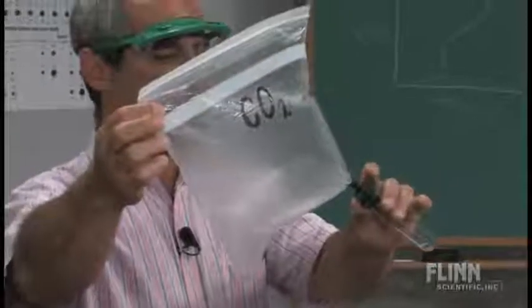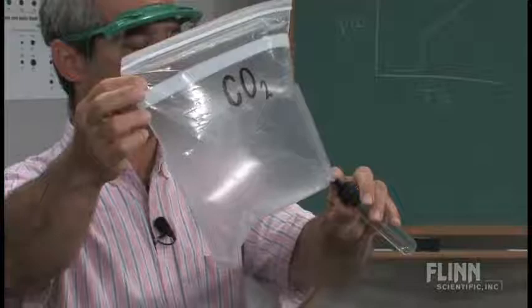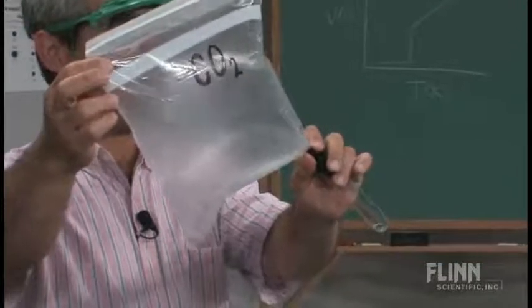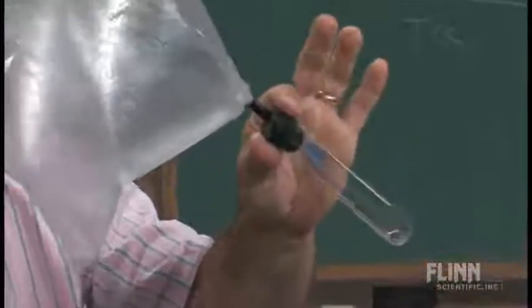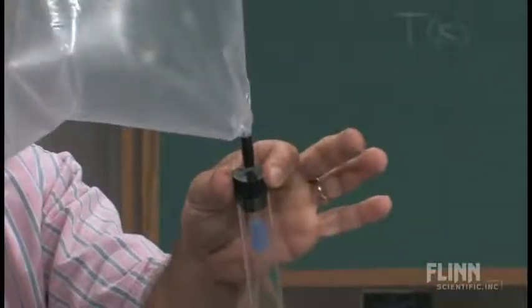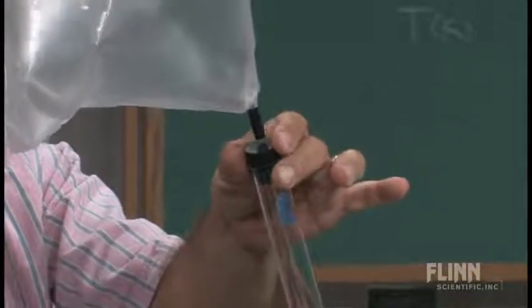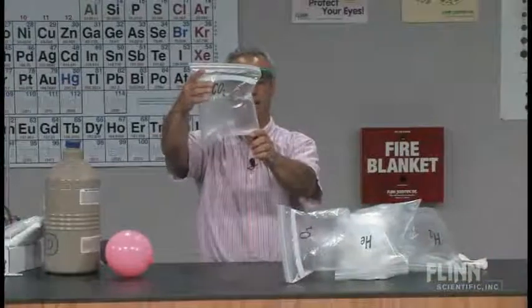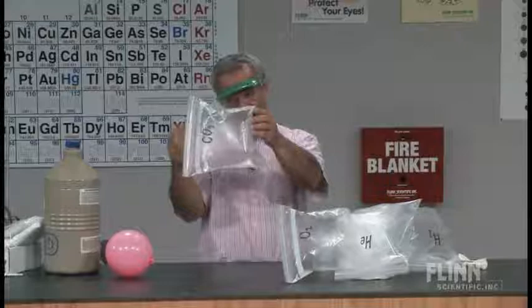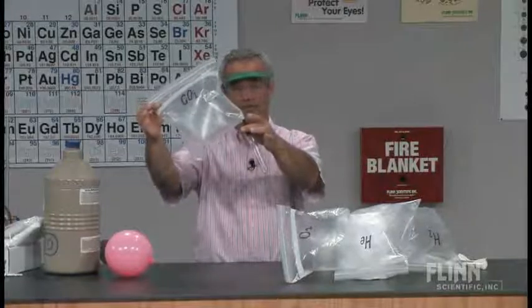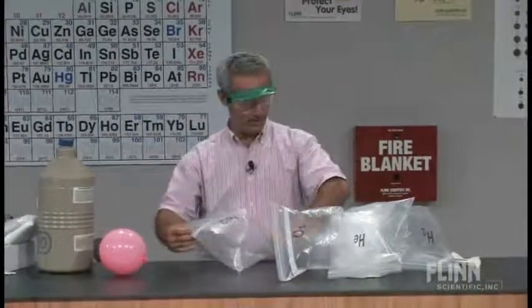By the way, you might notice how I've got these connected. I've got a little piece of glass tubing. I cut the very corner out of the Ziploc bag and then taped it to that glass tubing, and that makes for a very convenient little way of connecting a gas sample to a test tube. Carbon dioxide in here. Actually, this was made by taking a small piece of dry ice and putting it in there and letting it sublime, and now it's been filled with carbon dioxide for a while.